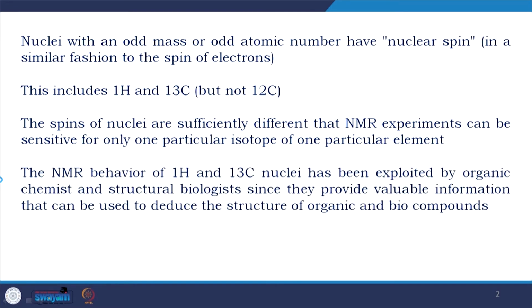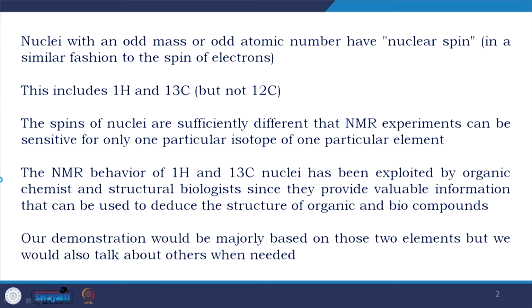The NMR behavior of 1H, the proton, and 13C nuclei has been exploited by organic chemists and structural biologists, since they provide valuable information that can be used to deduce the structure of organic and biocompounds. Our demonstration will be majorly based on these two elements, because in proteins, in any polymer, and in any small molecule they are the major components, but we would also talk about others when needed.